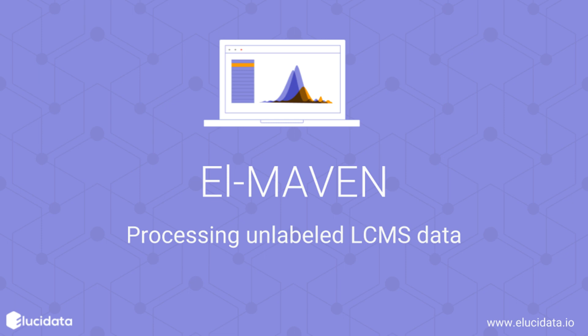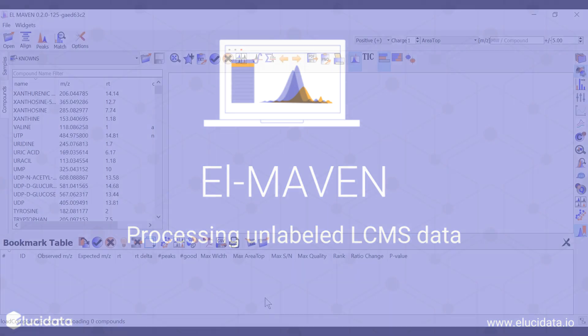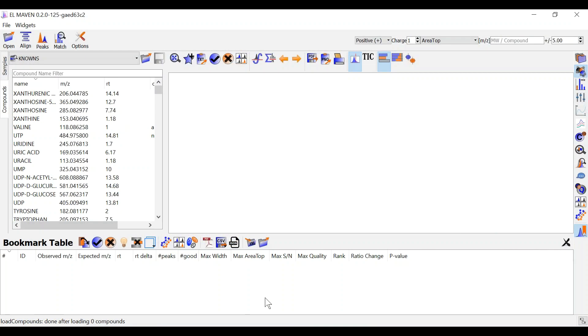Welcome to ElmAven Tutorials. Today I am going to walk you through the unlabeled LC-MS workflow for ElmAven.